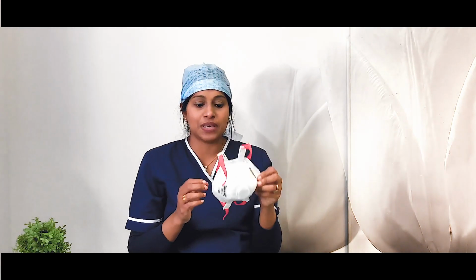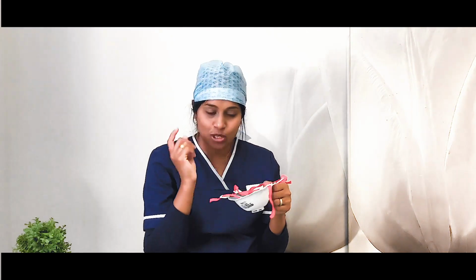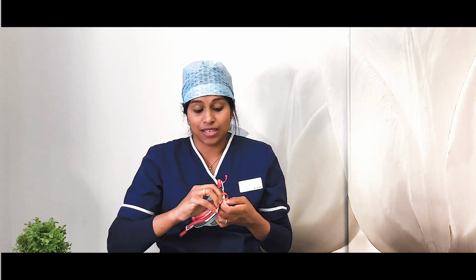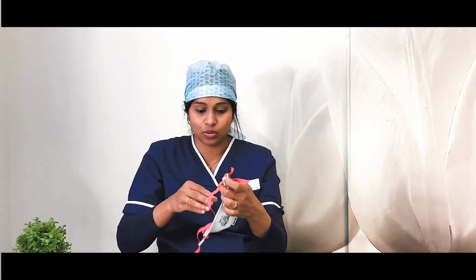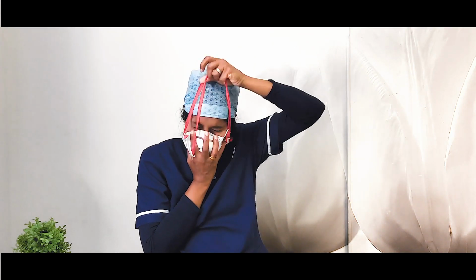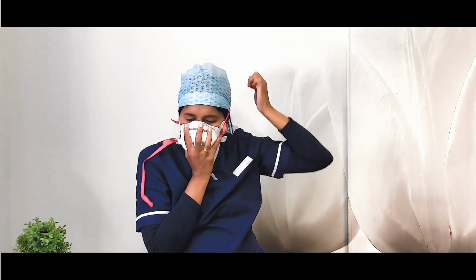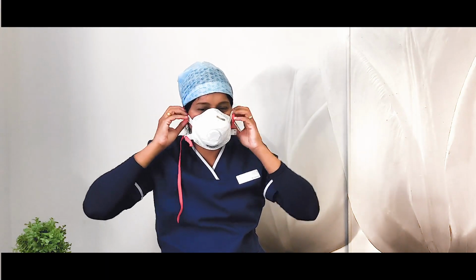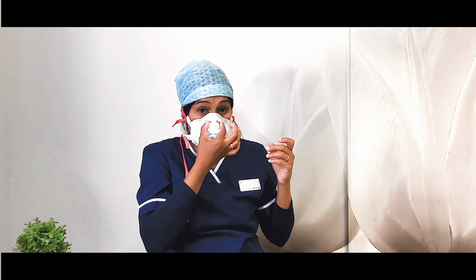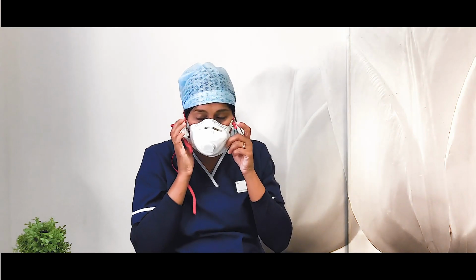Now you can also get the FFP3 cup shaped. The difference between an FFP2 and FFP3 is that these are adjustable, so you can adjust it to fit for you, so that it gives a good seal. So that's how it is different from FFP2. Again, it's very similar. You hold it down like that, and then you hold it on your face and then put it on, and then you can sort of adjust it. You just pull it tight, and that really gives it a good seal for an FFP3 mask.